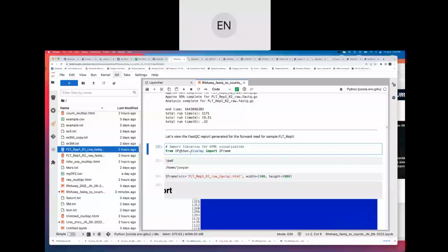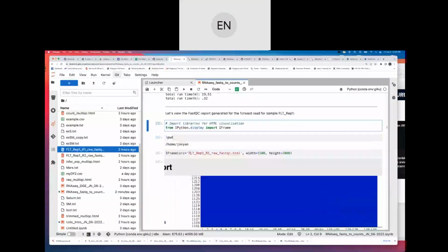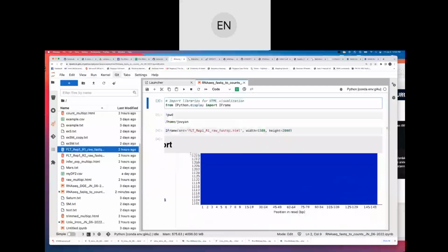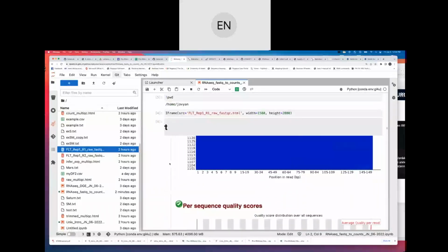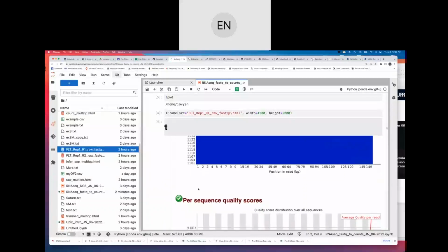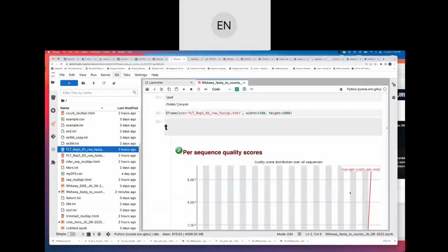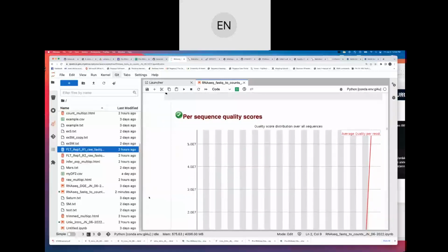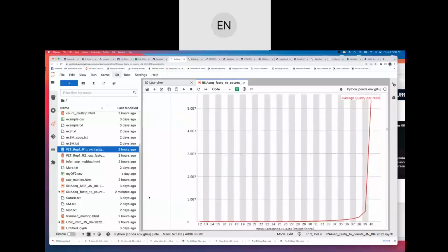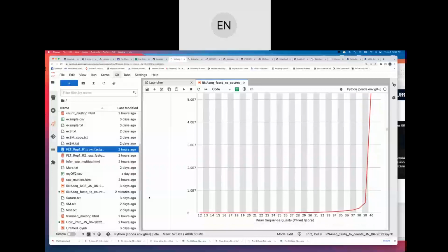I had that interruption. Here's the fastqc. I'm just going back and running everything. There's a slurm. Let me try again. Okay, here we go. Still not found. You want to share your screen? Sure.